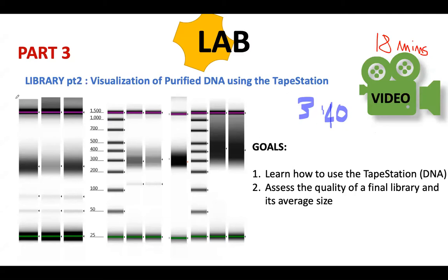If you remember from day 1, these were 3 different types of library preparation. Okay, so if you remember, this was A, B, or C. So we're trying to see our two libraries, which category they belong to. Our goal is actually to have one of the two libraries, the one that used the standard protocol, look like C, and the other library look like B, so to contain adapter dimers and maybe some primer dimers as in A. So that's our goal. Let's see how we did in the prep.